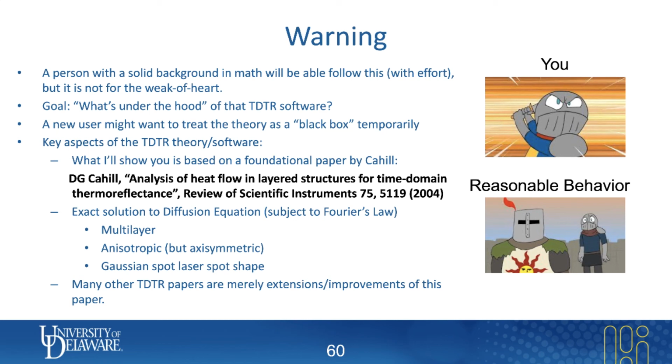And I would note that if you're going to do any TDTR for any period of time, most of the time domain thermoreflectance theory papers that I've seen have mostly been extensions of this paper. So you really need to understand every line of this paper in order to make contributions that go beyond this, I would say. So it's a pretty good foundational paper.